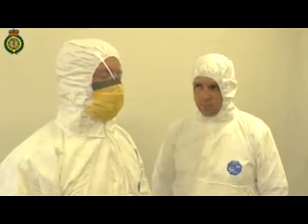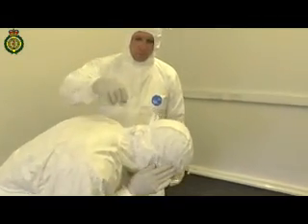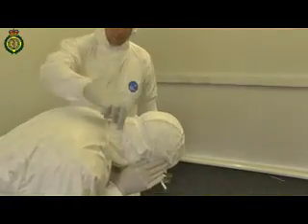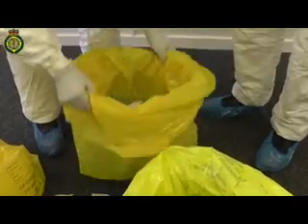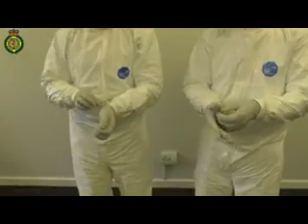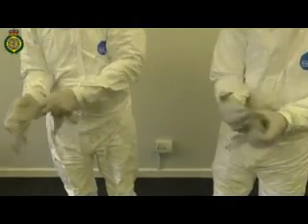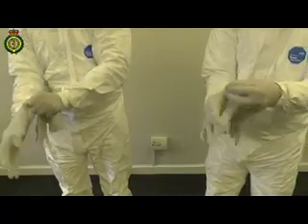If you are then helping a crewmate remove their mask, make sure you change your outer pair of gloves again before doing so, as your gloves will be contaminated from your mask. Make sure the clinical waste is securely inside the middle bag. Replace your outer gloves once again. Don't worry about the amount of gloves you're using. It's better to be safe than sorry.